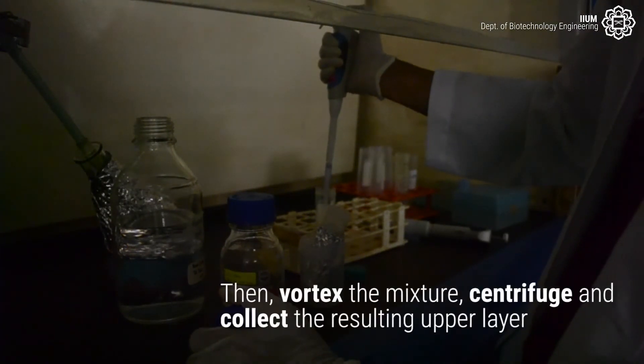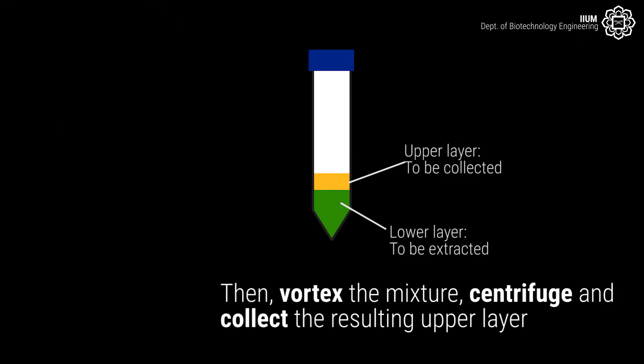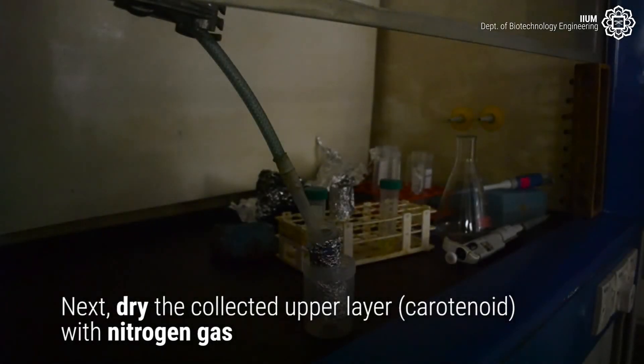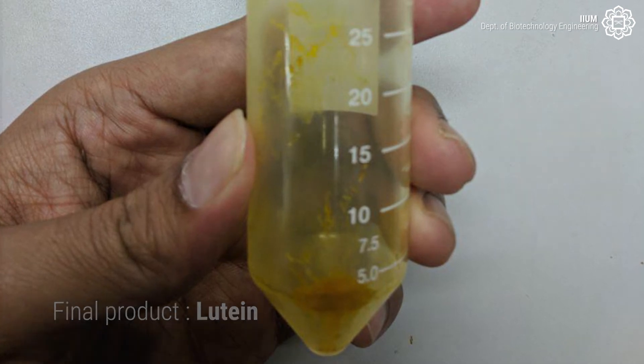Re-extract the lower layer with 0.1% weight over volume BHT in hexane by adding the BHT solution until 45 ml. Then vortex the mixture, centrifuge, and collect the resulting upper layer. Repeat the re-extraction steps until the upper layer is colorless. Next, dry the collected upper layer, which is carotenoid, with nitrogen gas. Finally, the product is lutein.